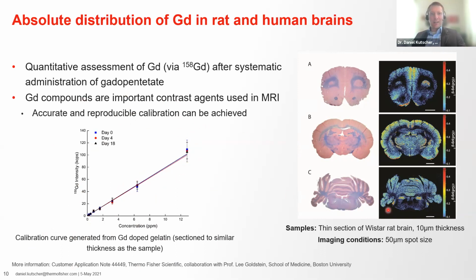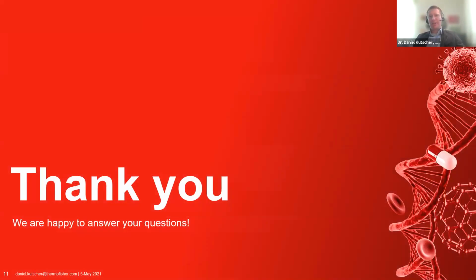weeks. And that is actually another very important step in order to make imaging a much more, let's say, widespread and much more widely used technique, because the qualitative information is already very indicative, is already also very important to have, but this can also be complemented by fully quantitative concentrations again. And here you can see it's not intensity that we display in the heat map of the sample. We are actually looking at gadolinium concentrations in microgram per gram. And with this, I would like to thank you for your attention and hand it back over to Thea.